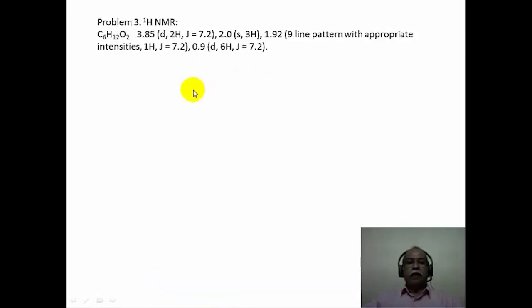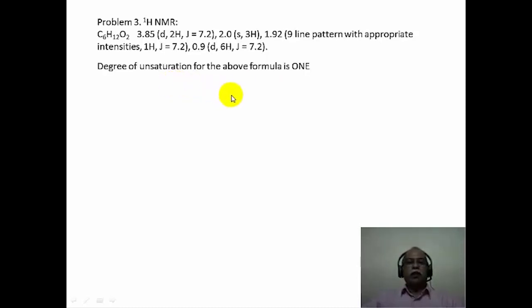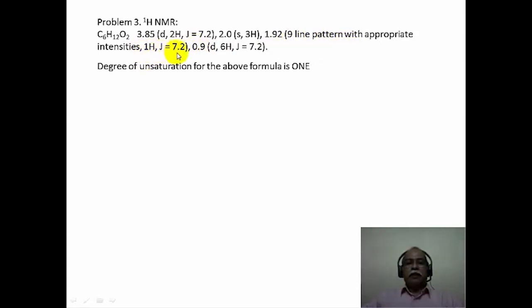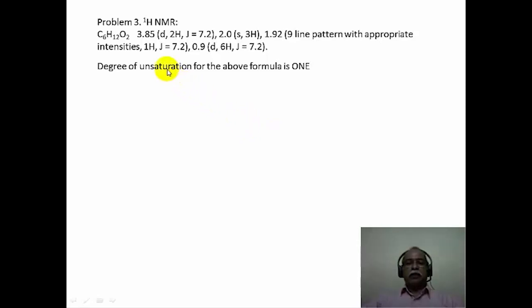In problem number 3, the molecular formula corresponds to C6H12O2 and the degree of unsaturation is 1. The signal at 1.92 ppm shows a 9-line intensity pattern with J value of 7.2 Hz, implying there are 8 adjacent hydrogens next to this particular CH group. This is a 1 hydrogen intensity signal, so there is a CH group with 8 vicinal hydrogens.